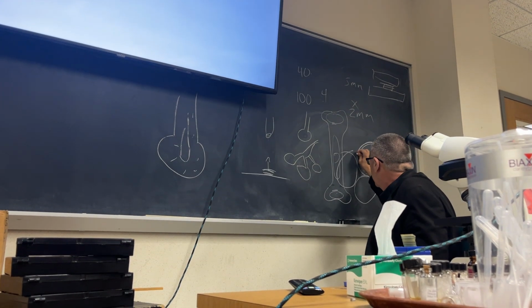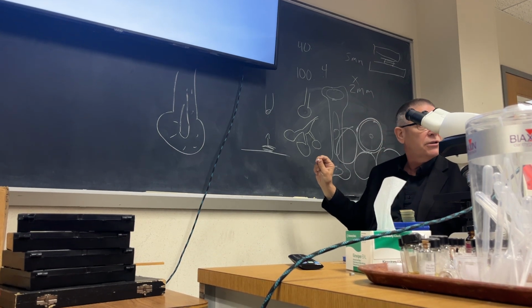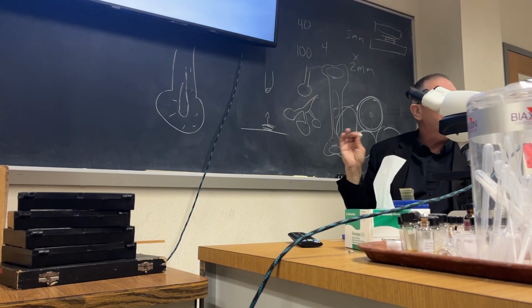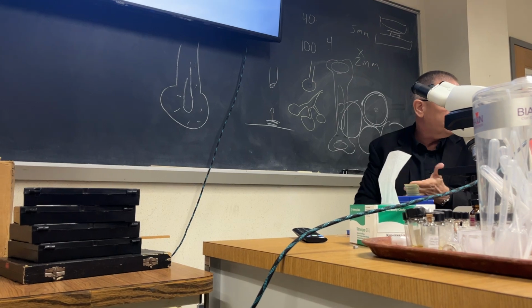Now, you will see little nuclei over here, which are the nuclei of the connective tissue, or of supporting tissue that's in that bundle of some sort. So there are a few nuclei in there, but don't worry about them too much. Okay?